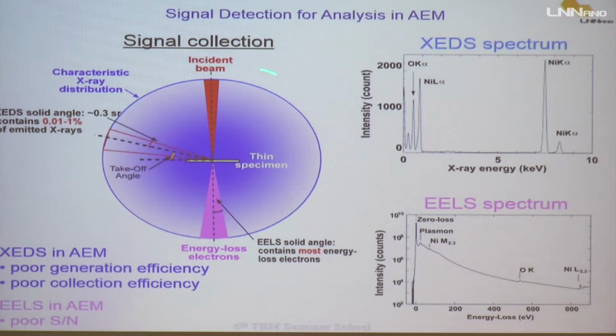It means that from the point where your sample is being struck, it will be a spherical wave. All these photons will be emitted through space with the shape of a sphere around the point of incidence. This is the idea.